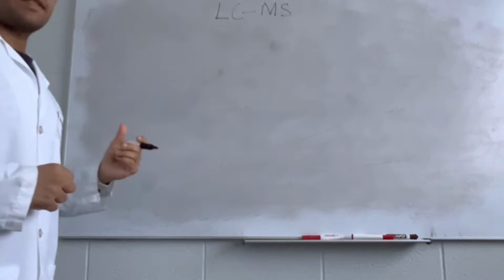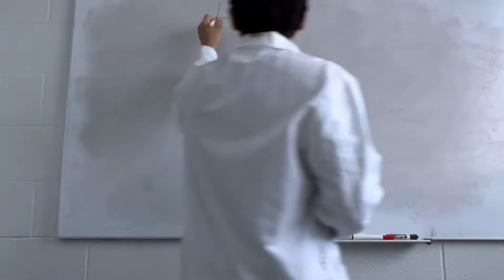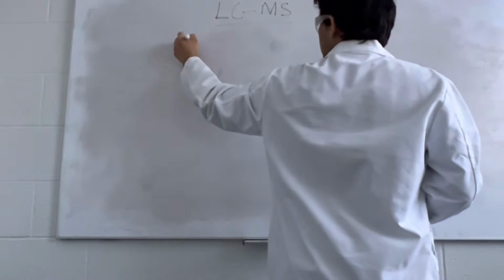In this video, we will discuss liquid chromatography mass spectrometry, that is LCMS.